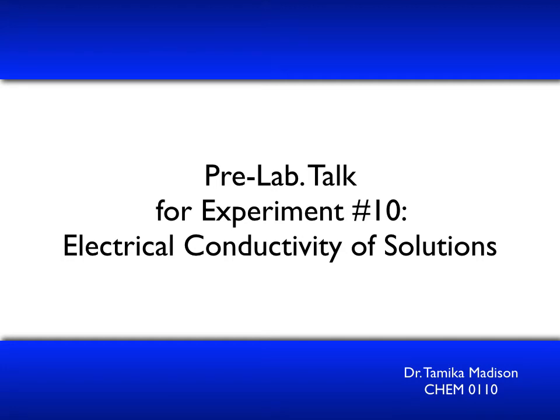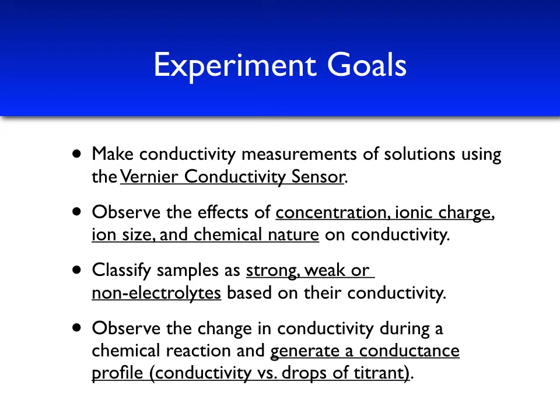This is the pre-lab talk for experiment number 10 for Chem 110, electrical conductivity of solutions. The goals for this experiment are to make conductivity measurements of various solutions using the Vernier conductivity sensor.